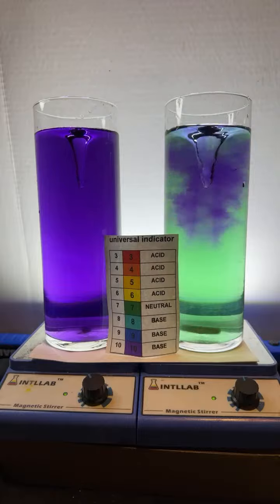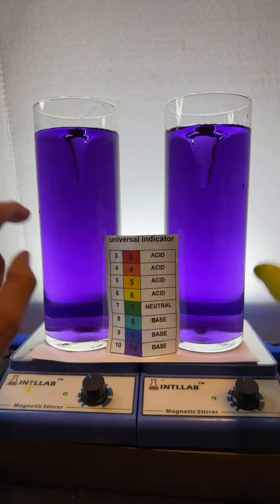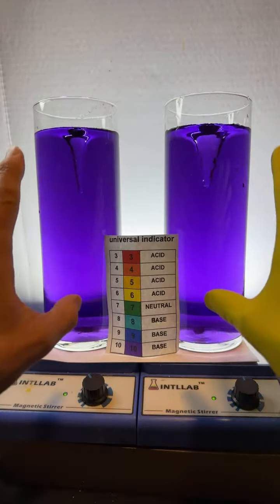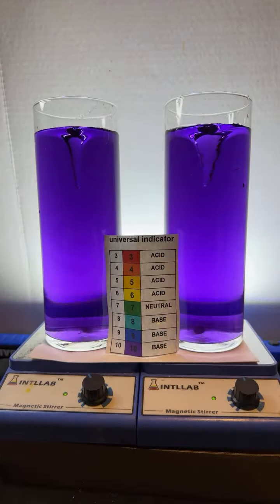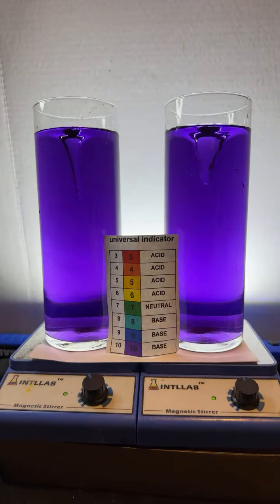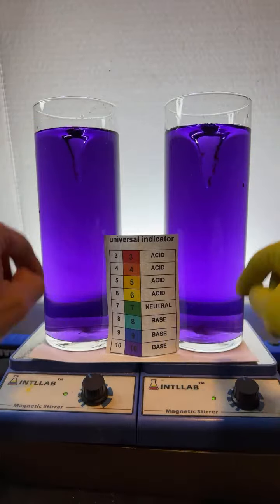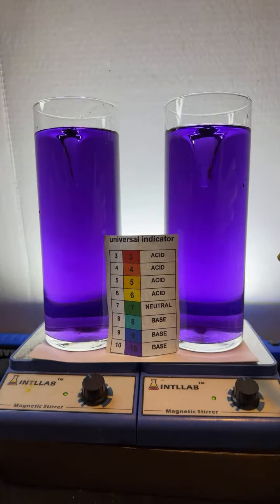So let me explain what's going on here. There may be some new folks here. Right now, both flasks are violet, and in each flask is just some water with some universal indicator. It's a mixture of chemicals that changes color depending upon pH, which is how acidic or basic something is. I see you, Patrick. Right now we see the pH is 10 because it's the violet color. That's very basic or very alkaline.